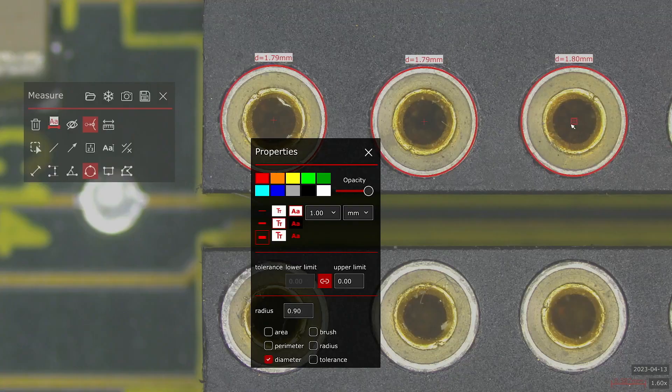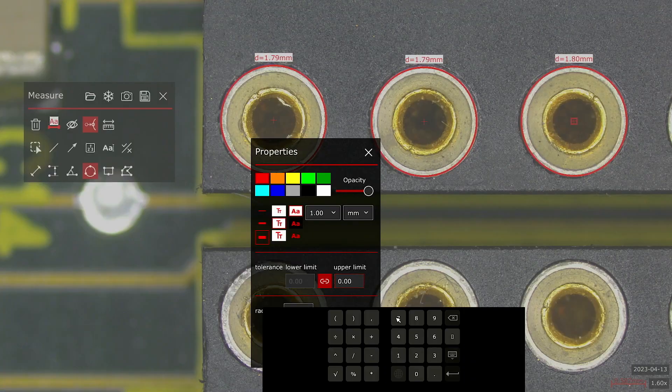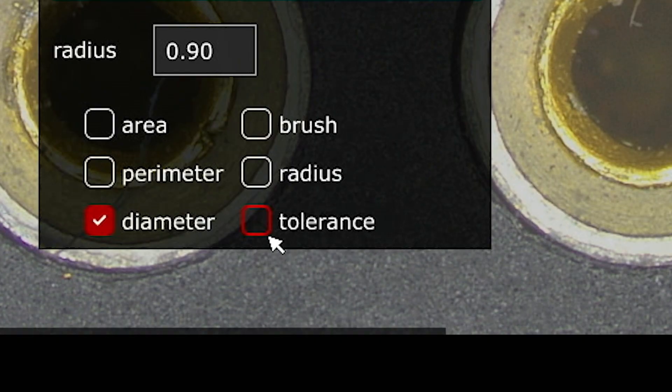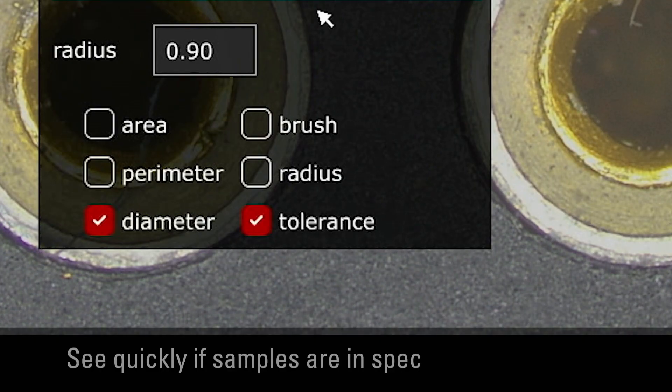Make it easier to judge whether your sample is in or out of specification by the addition of tolerance lines to the custom overlay.